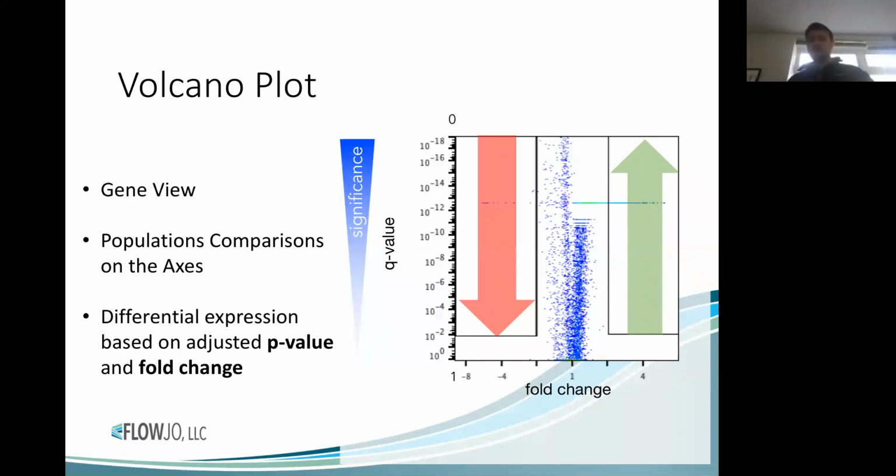We also have a y-axis that shows an adjusted p-value, also called a q-value, and that's performing a Mann-Whitney U-test, two-tailed, with a Bonferroni correction, in case you're curious. And of course, as we move up that scale, closer to 0, we get more and more significant genes with regard to our comparison. And as we move closer to 1 at the bottom of that inverted log scale, we are getting less significant parameters with regard to our two comparators, i.e. less reproducible. That's the prediction that's being made.